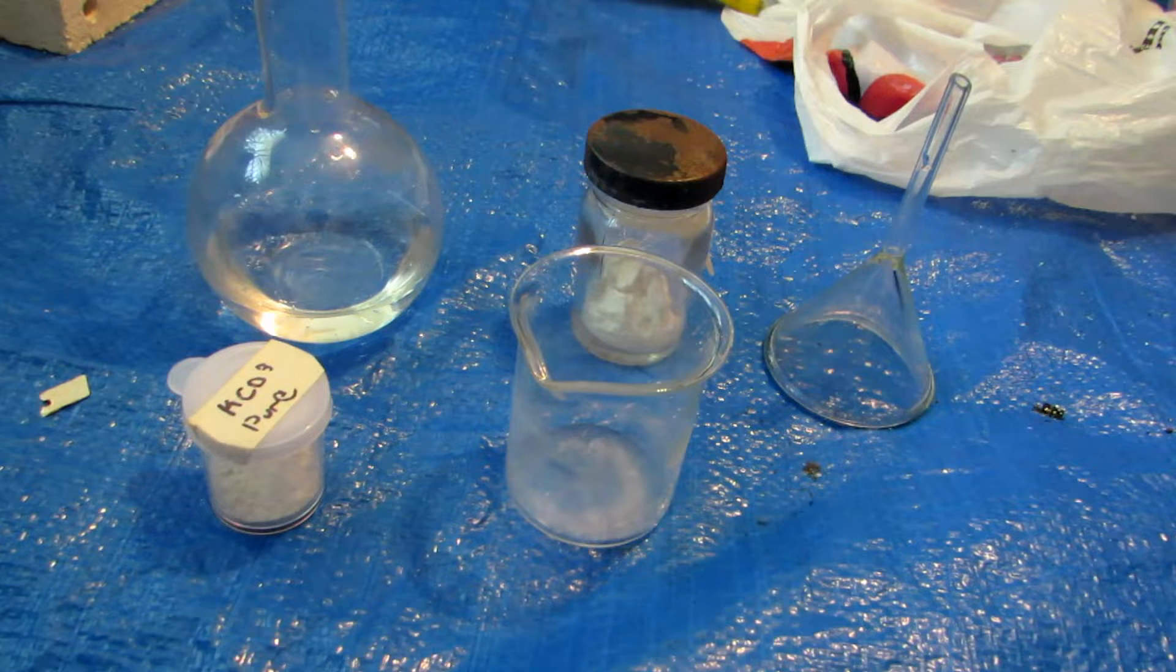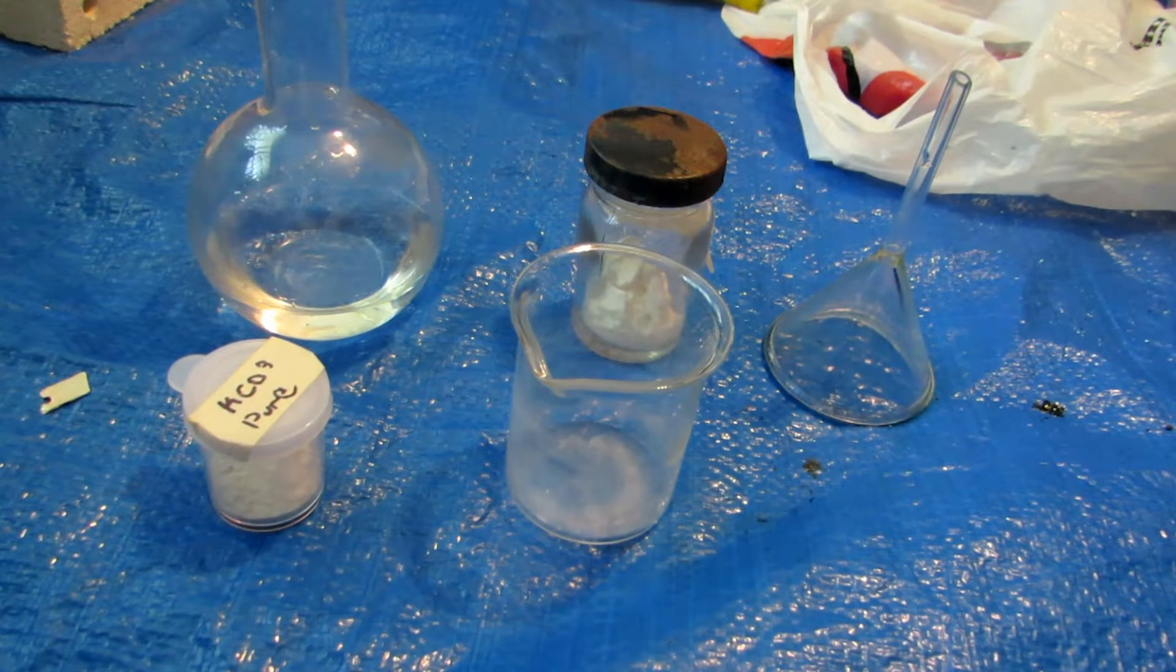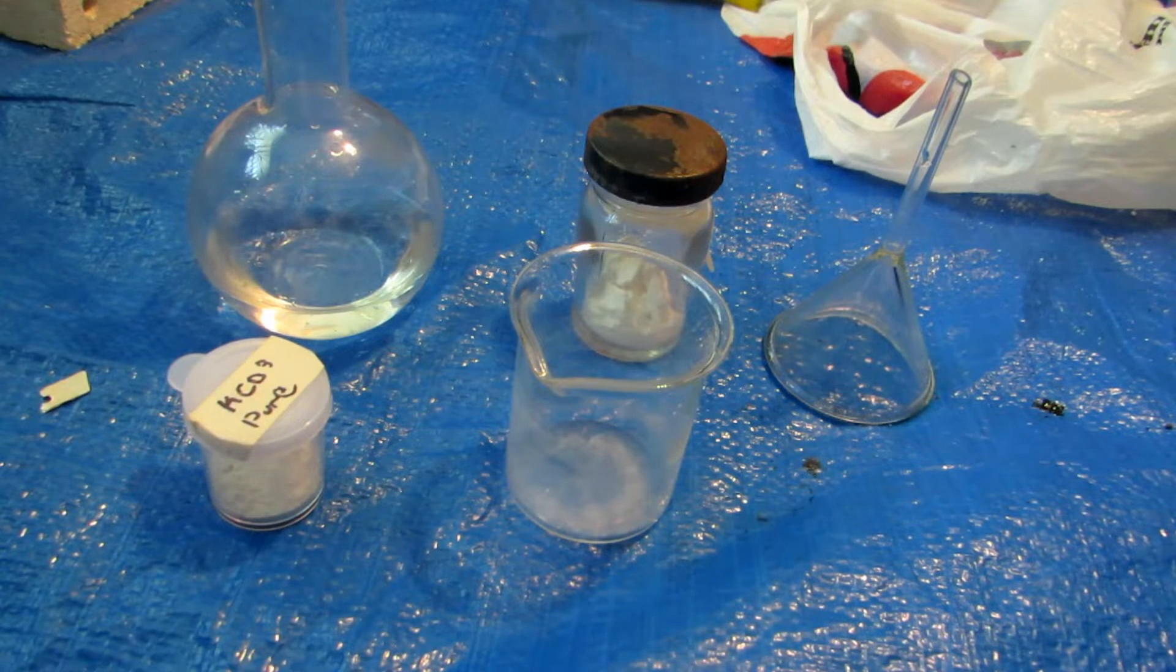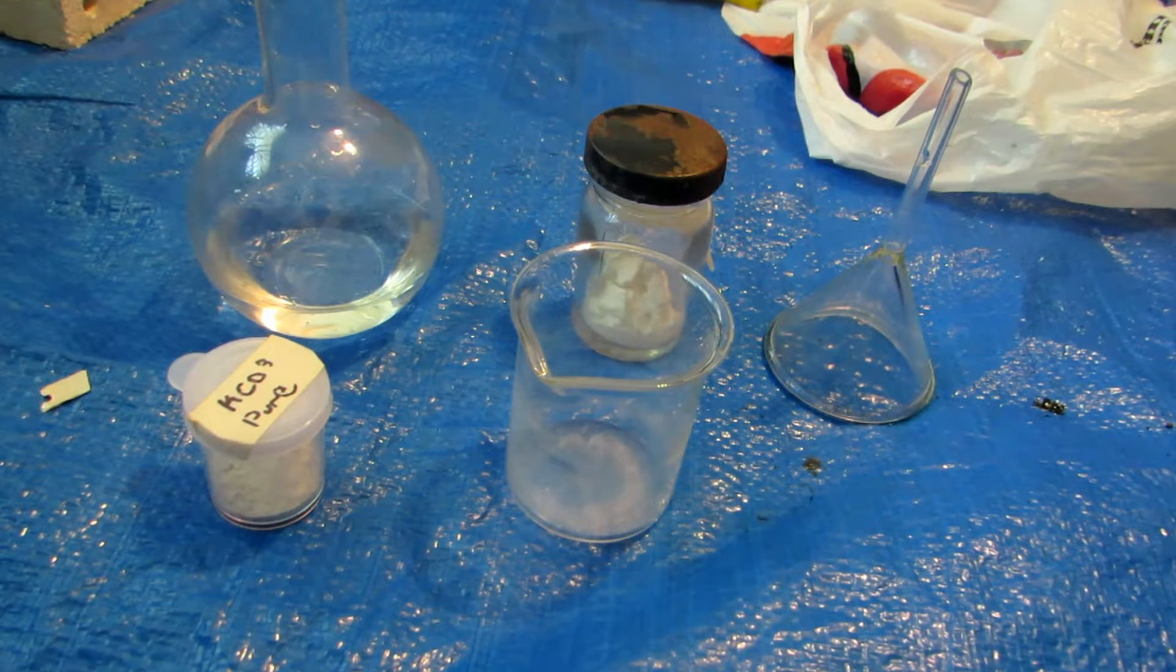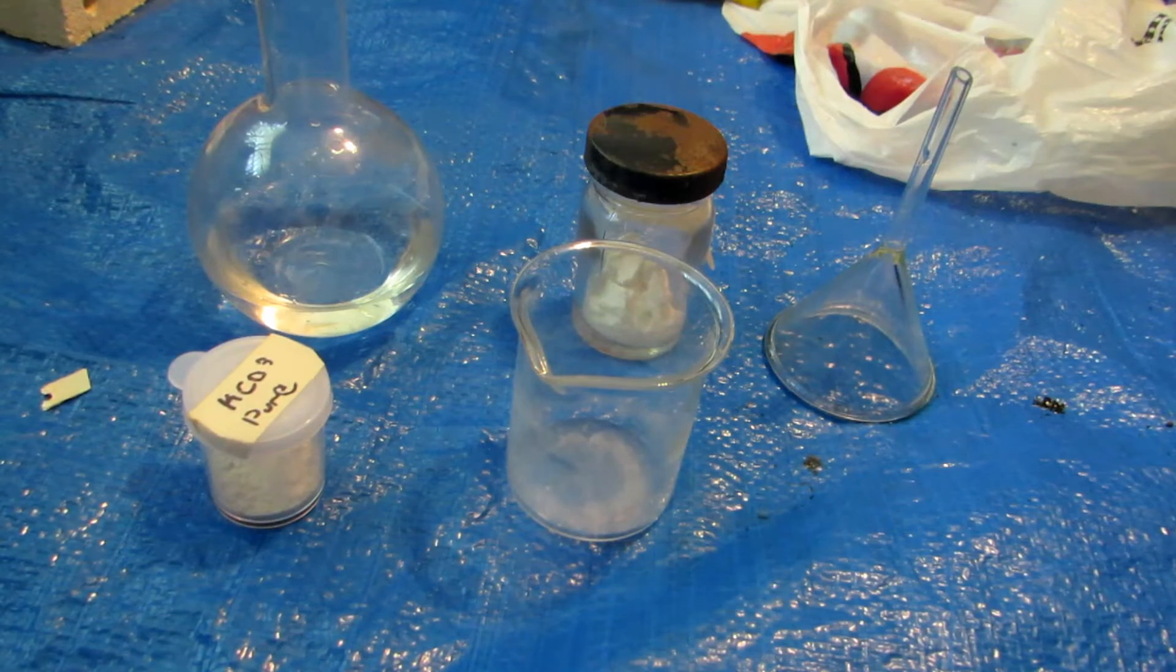Hey guys, welcome back to another video. So today we are going to be making a compound, potassium hydroxide, which is not easily available in all countries. In Canada, it's very difficult to find. You can buy it on eBay, but it's rather expensive, so I thought we'd go ahead and try to make our own.